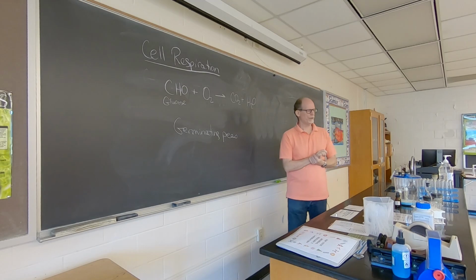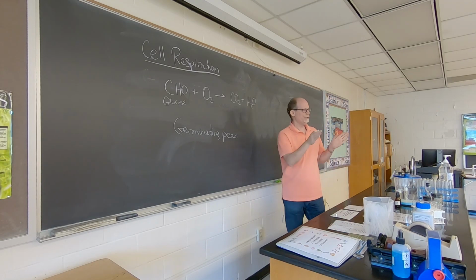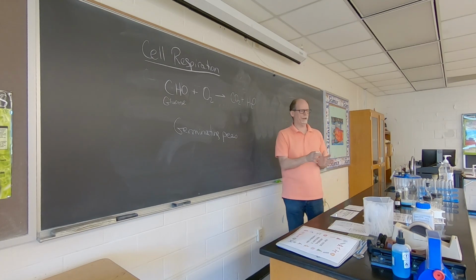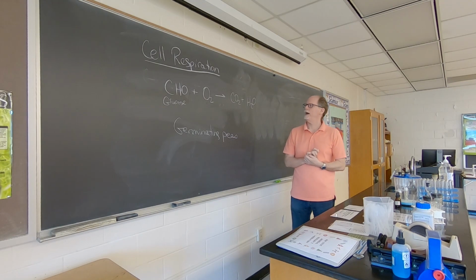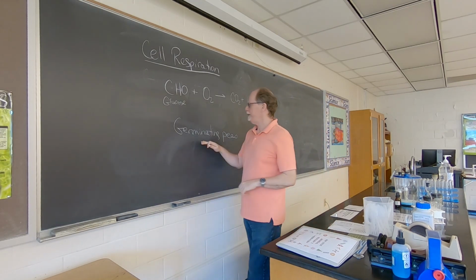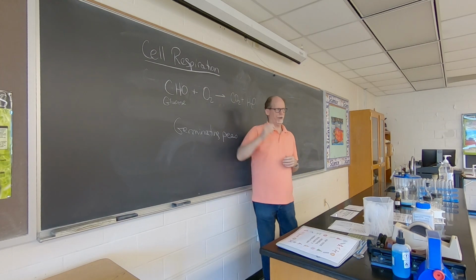So we've got a couple experiments that we normally do, that you guys would be doing in lab, but instead I'm going to do them up here in the front of the class. And we're using germinating peas as a model to represent cellular respiration.